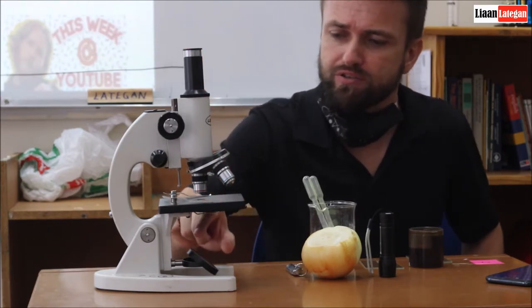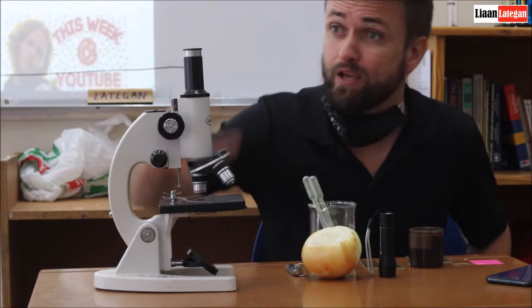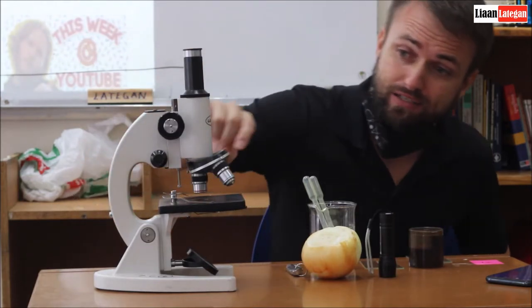So at the bottom of a light microscope you have the mirror, you have the eyepiece, you have the arm and the objectives.